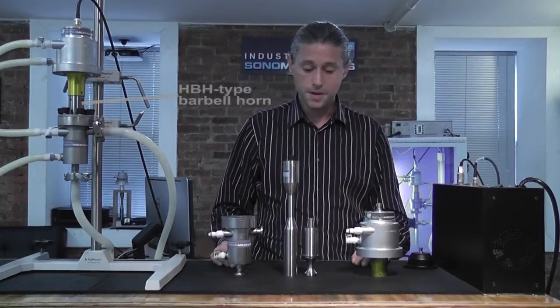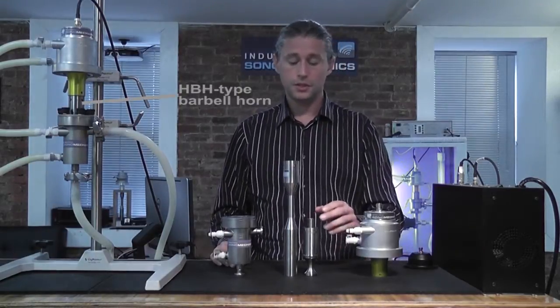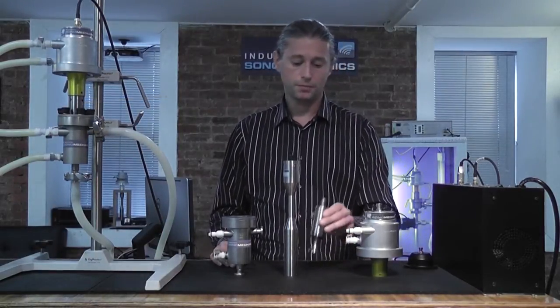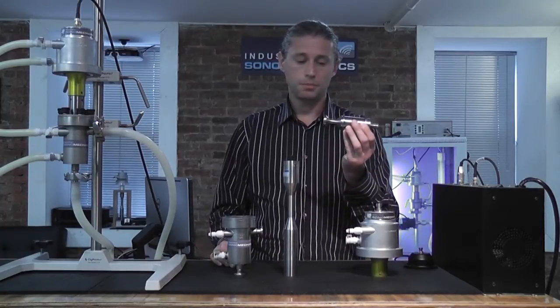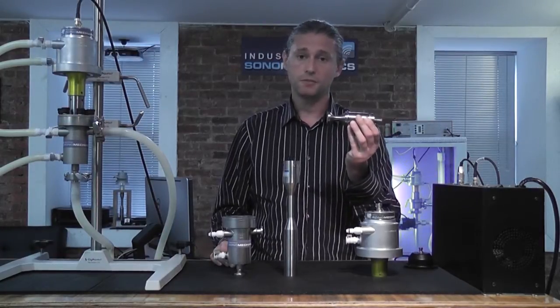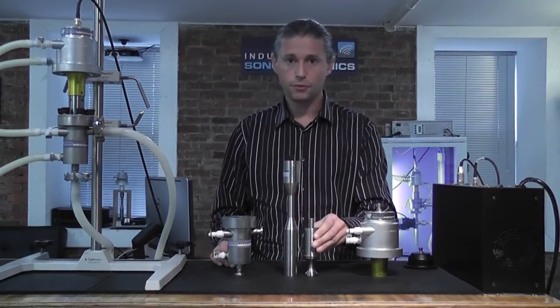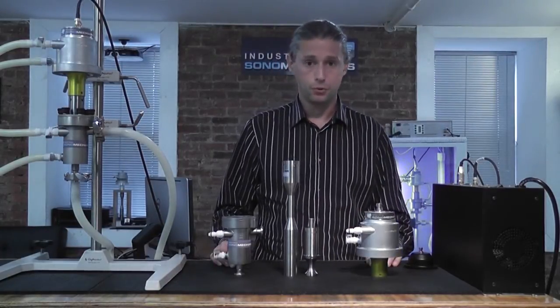Component number three is the barbell horn. There are several types of barbell horns available. The most commonly used type is the HBH or half-wave barbell horn. This is used for flow-through processing.